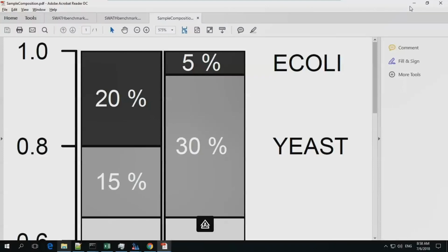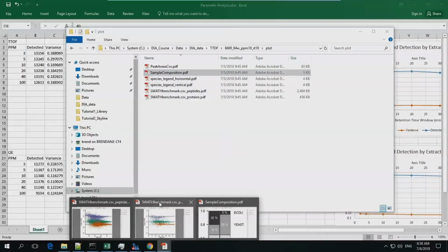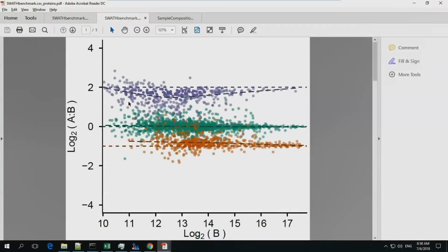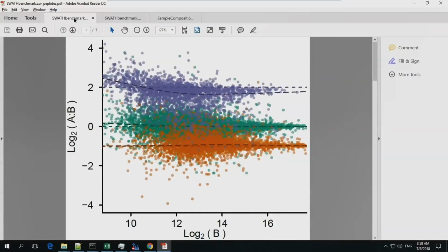So if that were actually a sample effect, then we actually wouldn't be super surprised to see that. I mean, it's definitely to see that. We also wouldn't be super surprised to see human shifting. Would they all shift in the same direction? I don't know for sure.